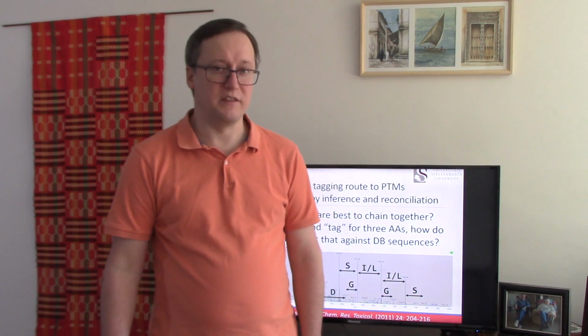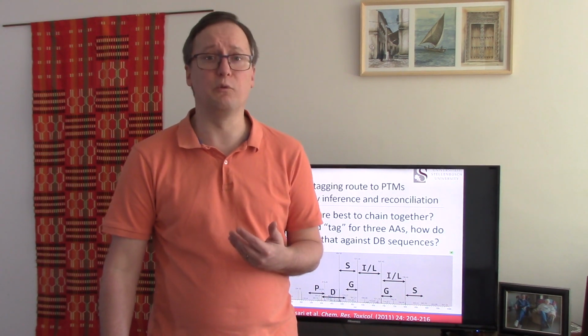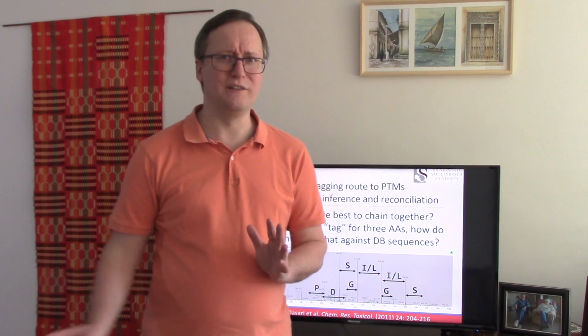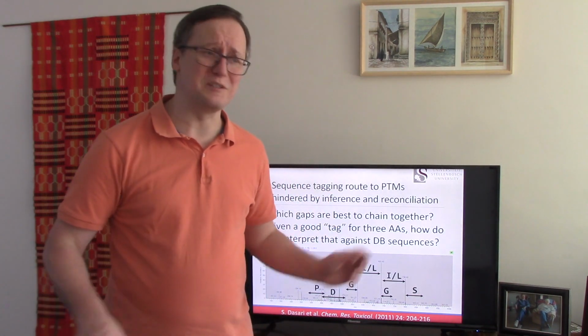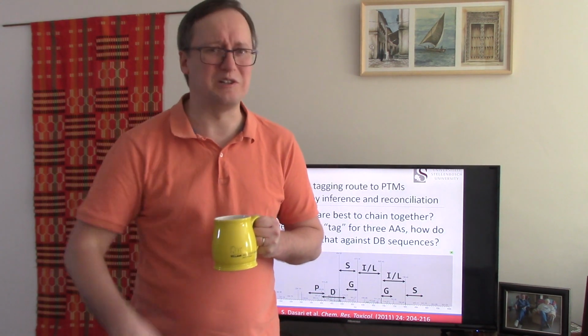And welcome back. From here, I'd like to talk a little bit about more advanced methods for hunting modifications. Now, having invested about 10 years of my life in getting sequence tagging working for recognizing modifications, I feel I would be remiss to leave it completely out of this talk. So this is my one slide on that topic. I hope you'll allow me to talk a little bit about it.